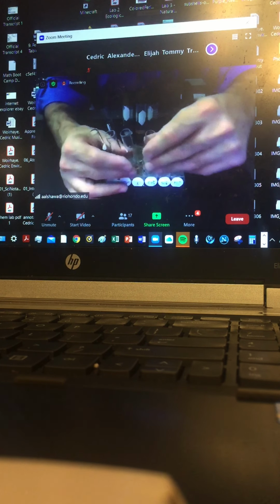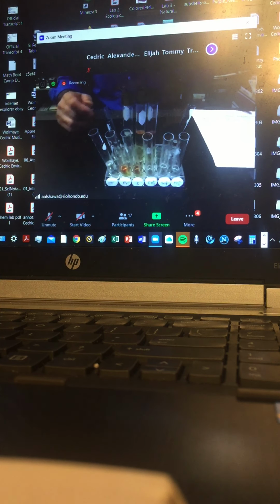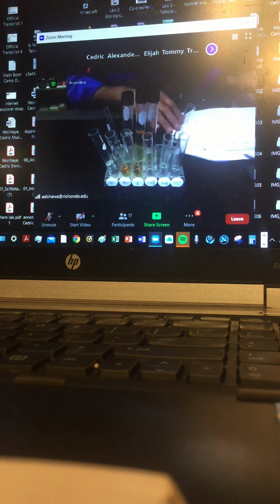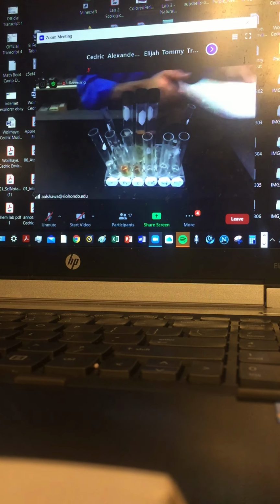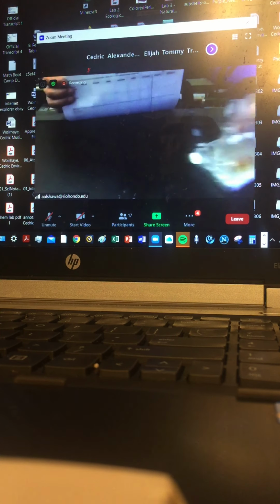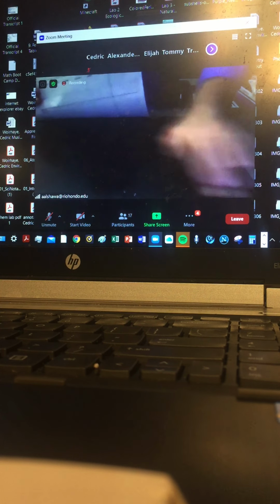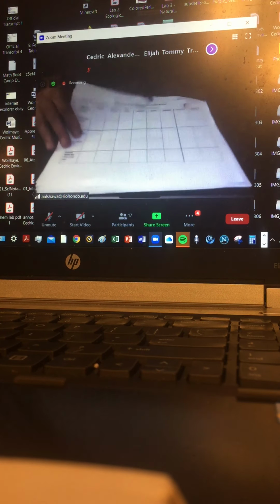Okay, so this is the last part, and at this point you should be able to figure out the unknowns. Right now we covered page 74, which is that sheet. That should be analyzing your unknown. When you go home, you have to analyze your unknown on your own. Based on results, we have those columns, so just look them up based on the column that we have.